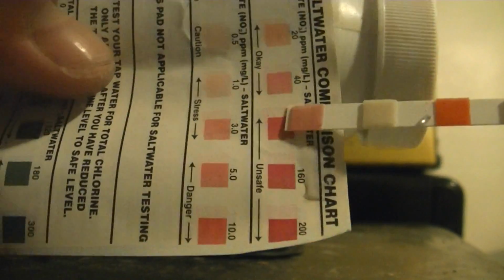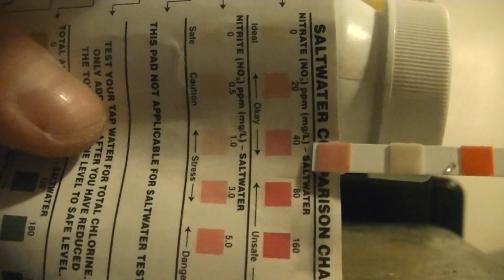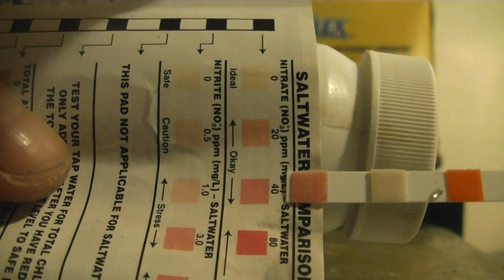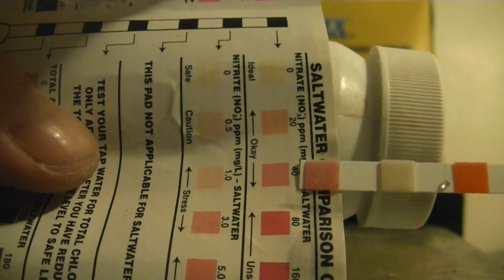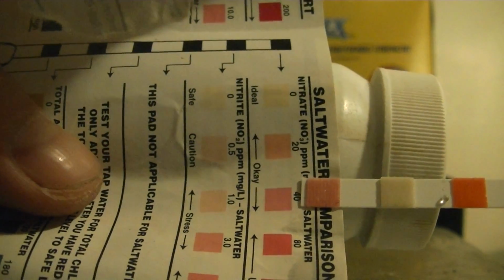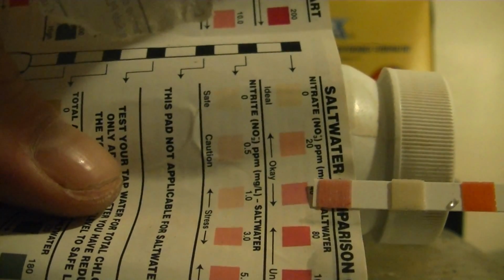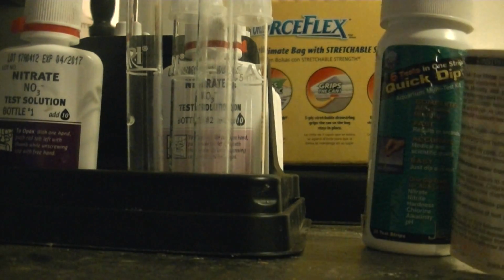Alright, so I don't know what you guys think. I'd say that's around 40 maybe, between 20 and 40. But it's hard to really tell exactly, but I'd say maybe 40. That looks pretty close to me. So this is saying we have about 40 parts per million nitrate. Okay, so that's the paper test kit. It's saying I got 40 parts per million.